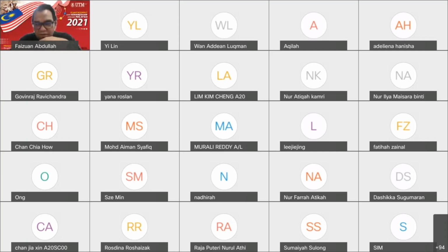It's quite a tricky question for you. Can we prepare directly from 1000 ppm to 0.1 ppm, 0.2 ppm? What happens if you calculate that? Okay, let me give you some figures. You need to prepare 0.1 ppm from 1000 ppm in a 100 ml volumetric flask. Can you give me a figure of V1 that we need to take from the 1000 ppm stock solution?